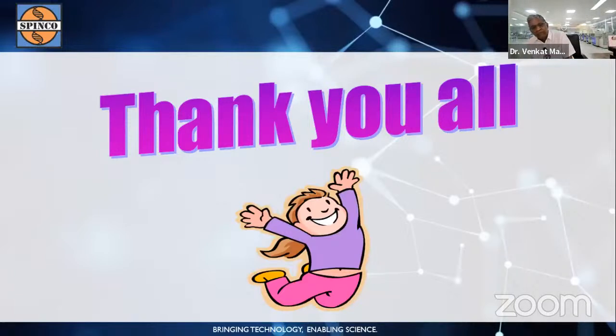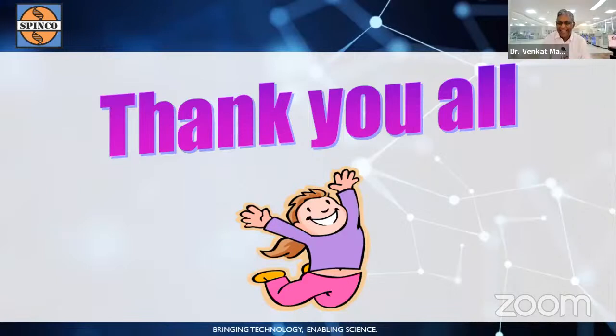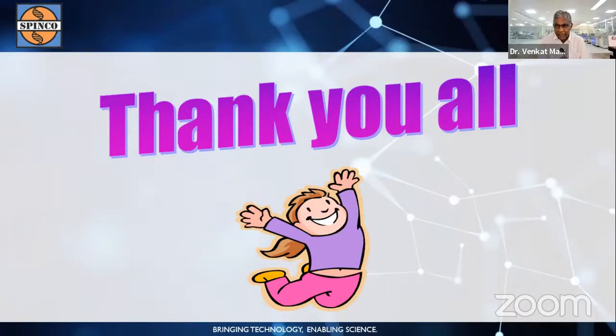How can I determine the purity of an isolated compound? This will come in the next lecture. I think a lot of the questions are for the next lectures, so you need to stay tuned. What are the signs of mass spectrometer contamination? Sample preparation plays a very important role in contaminating the mass spectrometer.